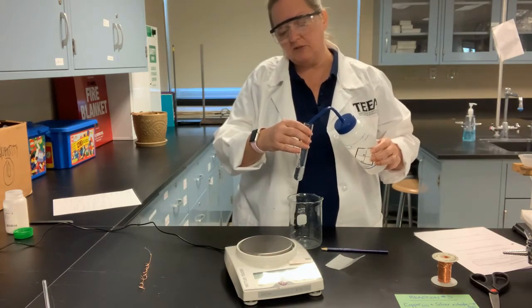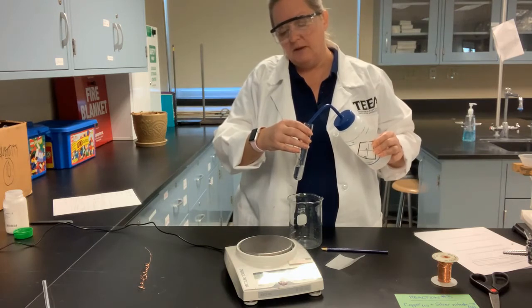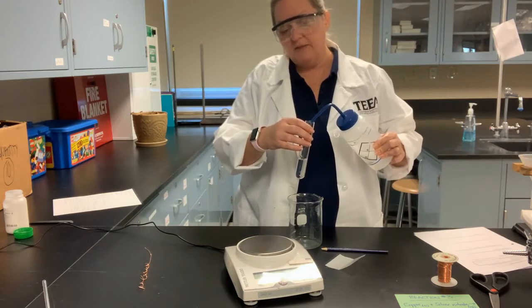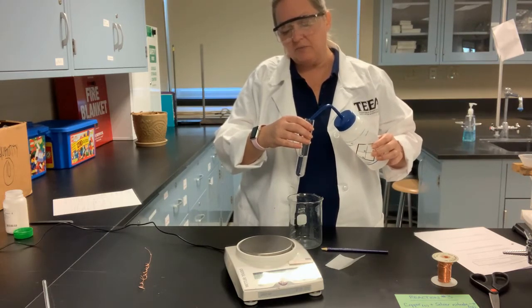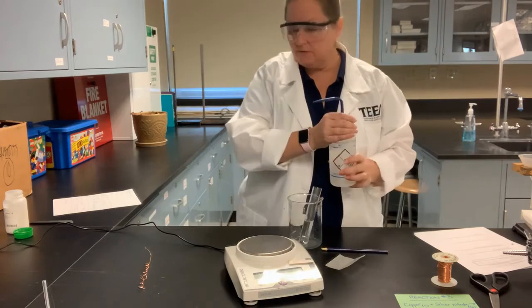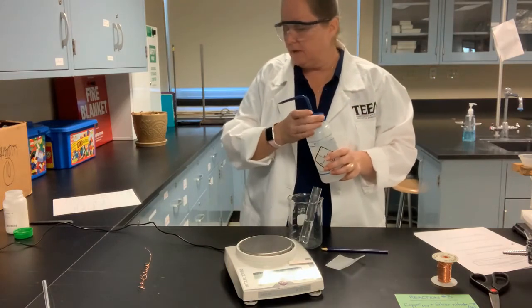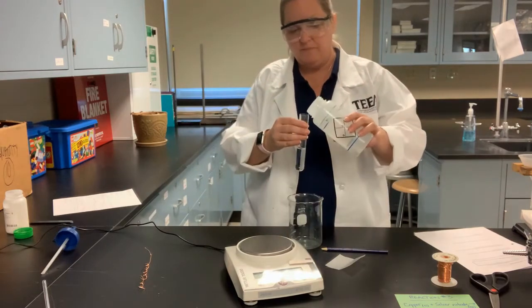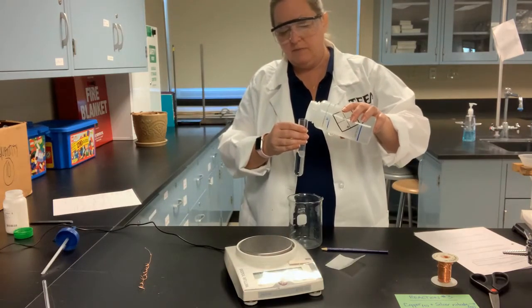Once the silver nitrate is in aqueous solution, then the silver and the nitrate ions become available to react with the copper metal. And this reaction isn't a fast reaction. We're going to give it about 24 hours to go to completion. And this is going a little bit slow here, so I'm going to move it along by going ahead and removing the top of my deionized water bottle and pouring it in.